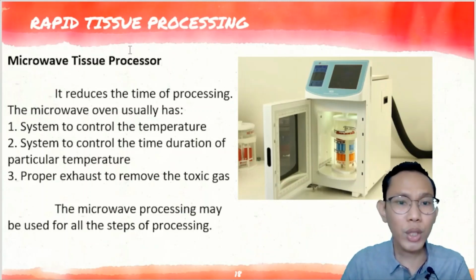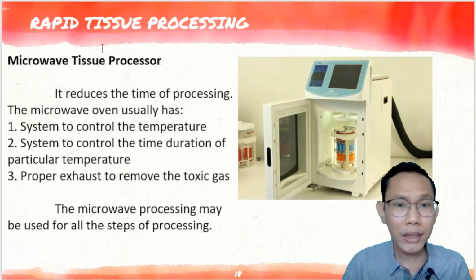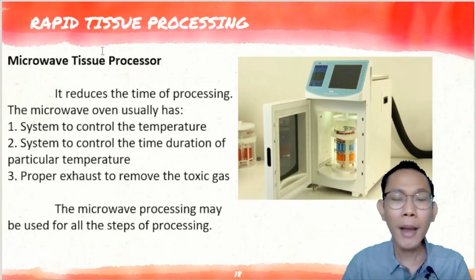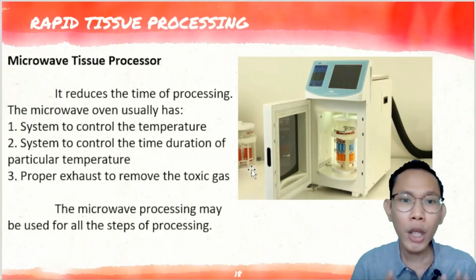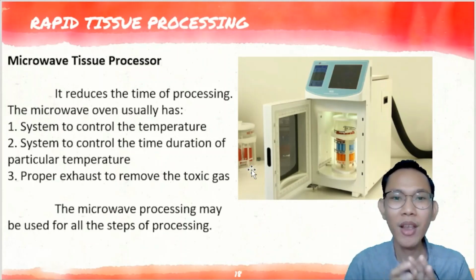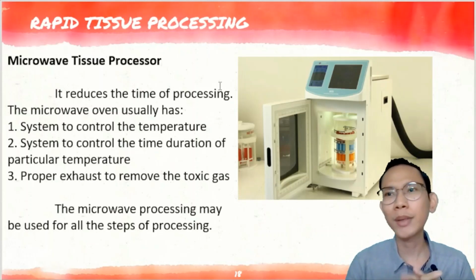But with the use of a microwave tissue processor, a microwave-assisted processing allows dehydration to be done in only one step and employs a 4-step process involving a single change in your ethanol and isopropanol, followed by 2 changes in paraffin. In short, your microwave tissue processor will shorten the process. Once na-shorten niya ang process, mas lalong binibilisan niya yung tissue processing. Kasi nga, ganito, baka magulat kayo.